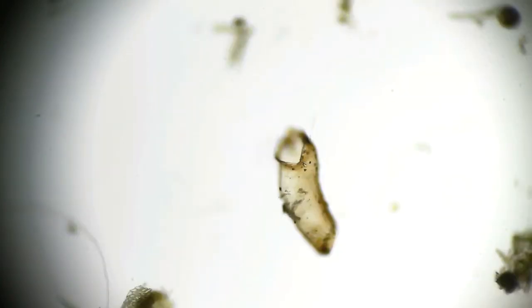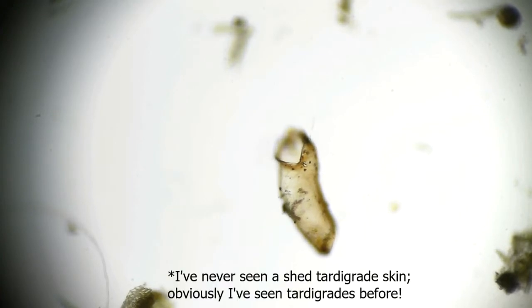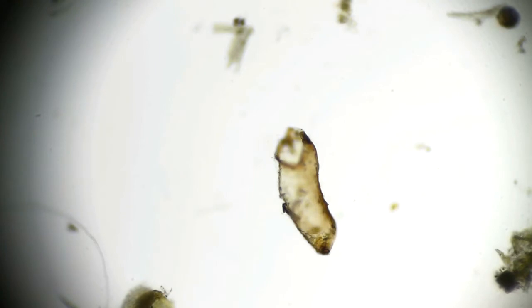Here's another empty sac of some kind. I know tardigrades do shed their skin as they grow. I've never seen one, so I don't know what one looks like. So completely guessing here that it could be something like that, but it could also just be an egg sac of some kind. There's so many interesting things in these samples, even if you don't actually find any tardigrades. I'm just trying to give you a snippet of a few of the things that I commonly see in these samples. I am no expert on what all this stuff is or how it works. So yeah, hopefully you're finding this interesting.